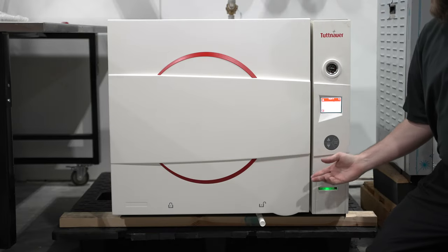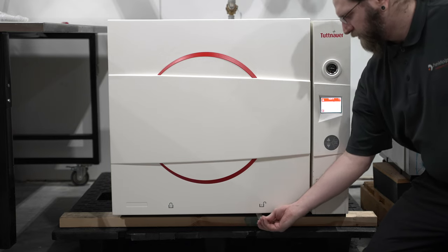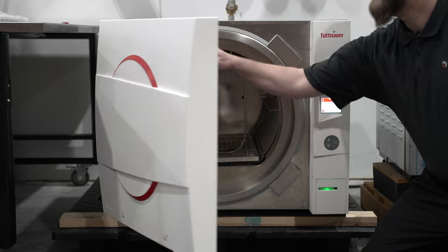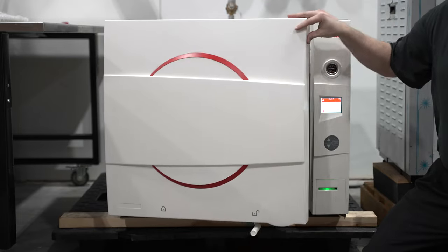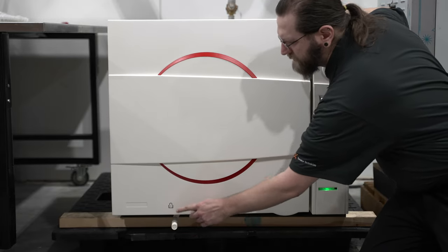Our largest units have the integrated door locking lever. To unlock the door, move it all the way to the right with the unlock symbol allowing you to open it. To re-secure the door, simply close it all the way and move the lever to the left to indicate locked.